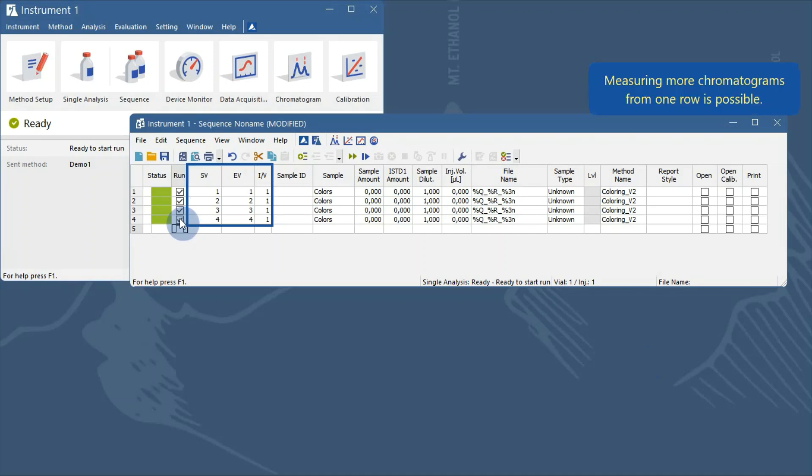In Clarity, injecting more than once from one vial, or measuring samples from more vials on one row, is possible. In my case, in row 1, I want to measure the sample twice from the same vial, so we will change the number of injections per vial to 2.